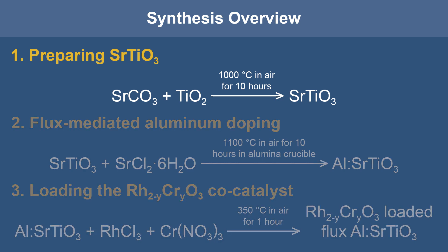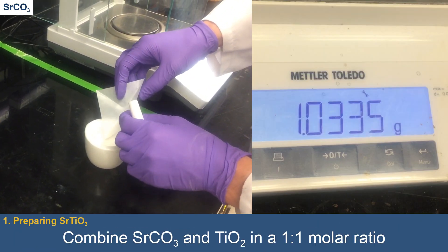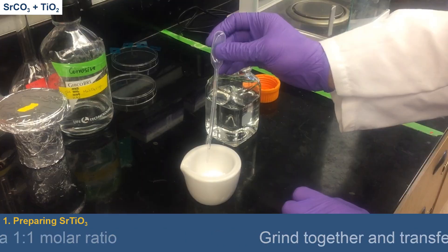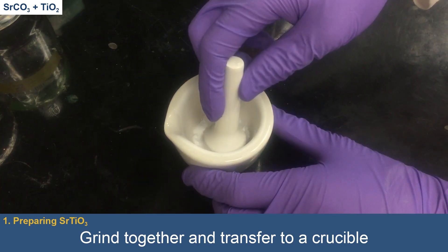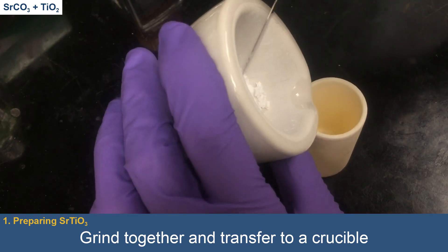Let's begin with the synthesis of strontium-titanate. Strontium-carbonate and titanium-oxide powders are combined in a 1-to-1 molar ratio. The powders are ground together with a mortar and pestle, with a small amount of ethanol added to aid in this process. The mixed powder is then transferred into a crucible and compressed into a pellet.